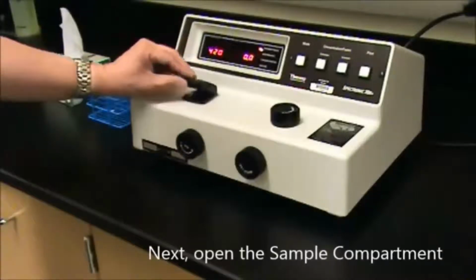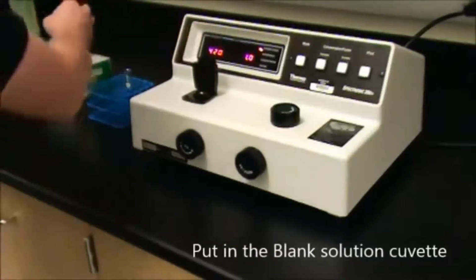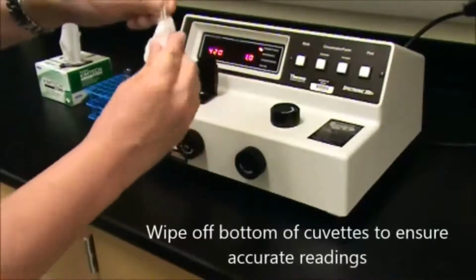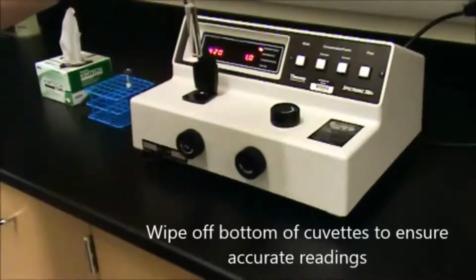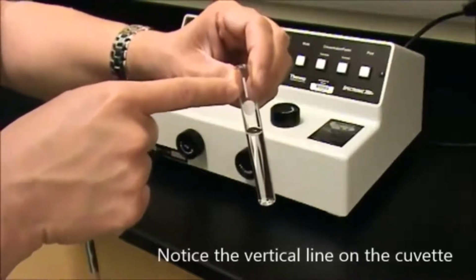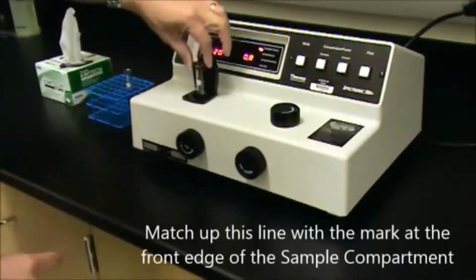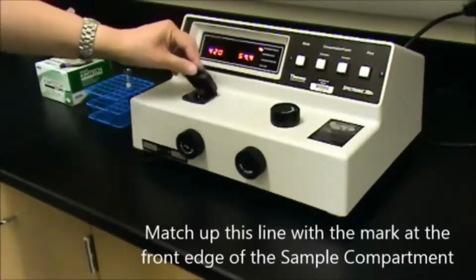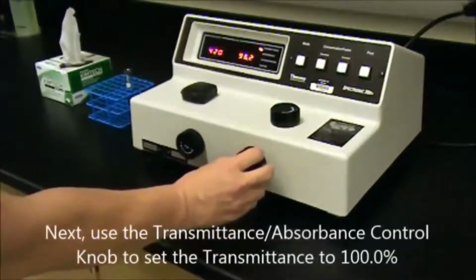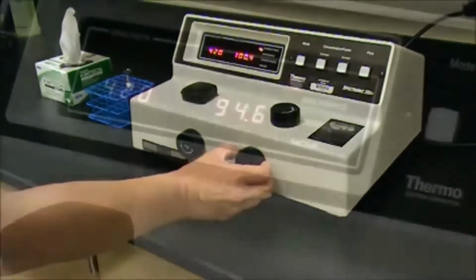Next thing you should do is now open up the sample compartment and put the blank solution in. You should always wipe off the bottom of your cuvettes before you insert them in the machine to make sure that nothing interferes with the reading. Also notice that there's a little line shown in the front of the cuvette. Line that up with the dash on the front of the sample compartment and then insert it all the way inside and then close the sample compartment. This time you're going to use the absorbance transmittance control and turn it appropriately one way or the other until you get 100 on the dial.